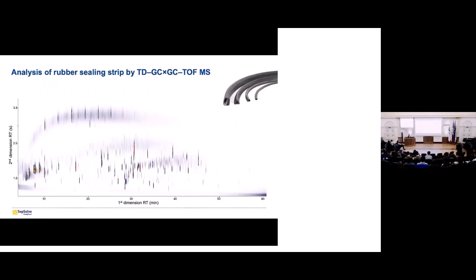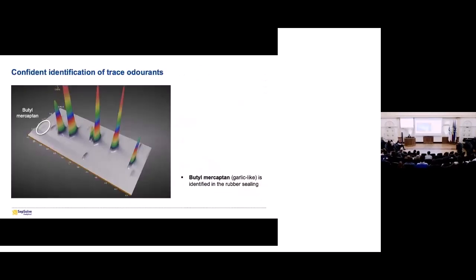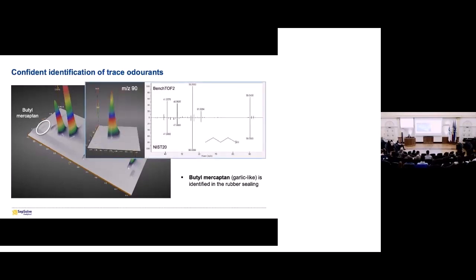And just to take a quick look at the rubber one, in this example, this is where the odor aspect came in. Because if we zoom in at the front end, where there's a lot of the very volatile components, we can see we've got this peak at the beginning here, which was identified as butyl mercaptan. And that has a really undesirable garlic odor, which you don't want to be present in the cabin of your vehicle. So having that flow modulation to be able to look at the volatiles and identify these compounds is really important.